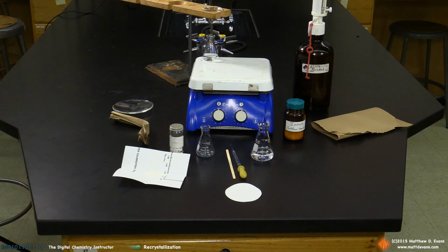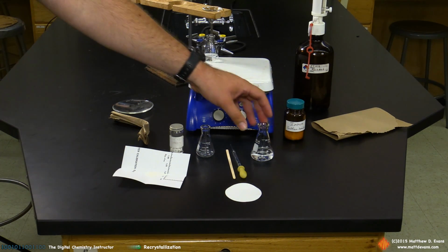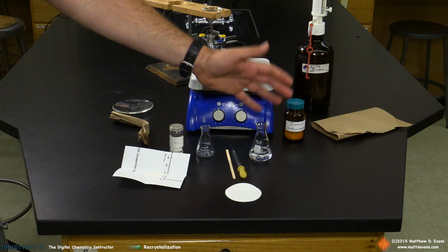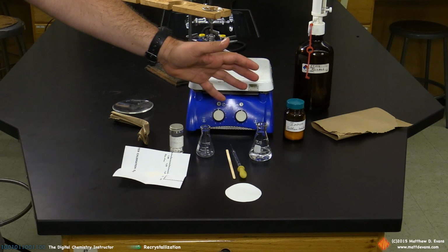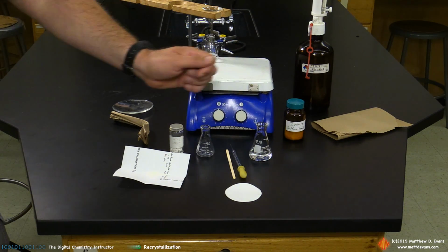In this experiment, we're going to be recrystallizing impure sulfanilamide, which is a compound that's described by your textbook. These are the tools of the trade. I've got a bunch of stuff laying out here. I've got a bigger 50 milliliter Erlenmeyer flask that I've already previously put solvent into. The solvent that we're using today, we already know what it is. It's ethyl alcohol. We're going to use that to recrystallize.